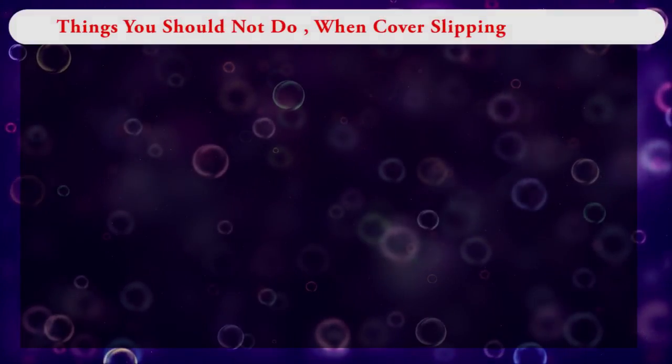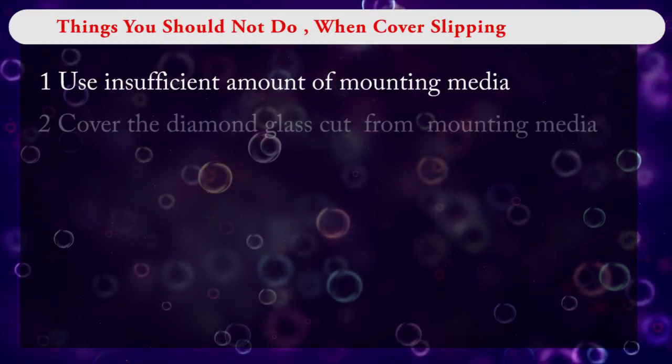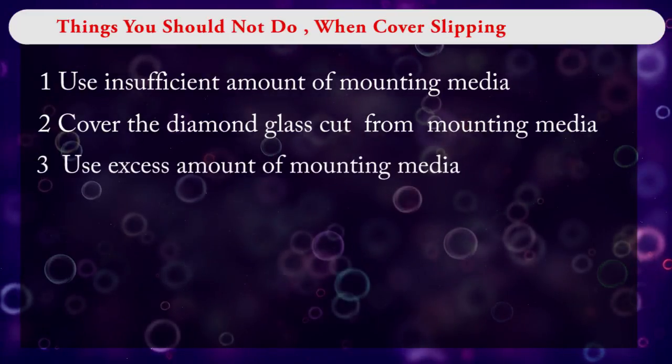Things you should not do when cover slipping: use an insufficient amount of mounting media for cover slipping; cover the diamond glass cut from cover slip and mounting media; use an excess amount of mounting media for cover slipping.